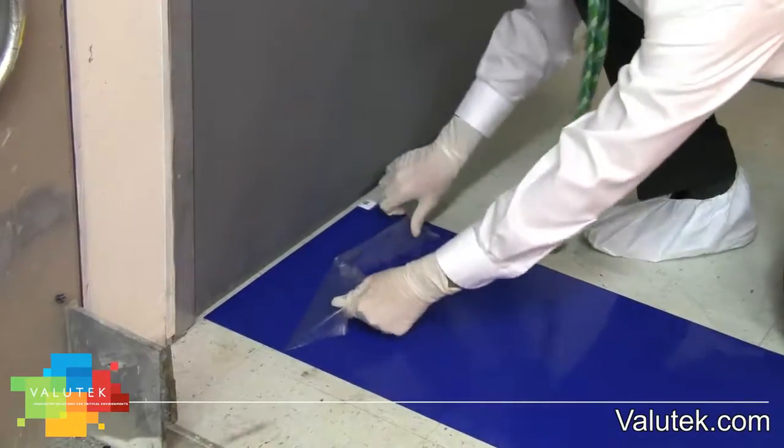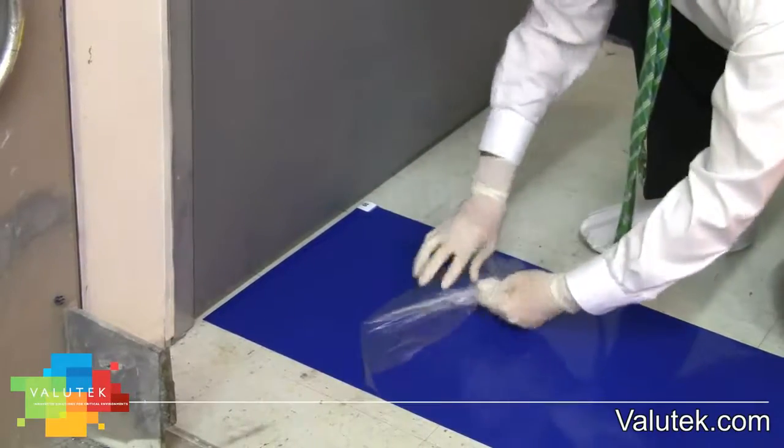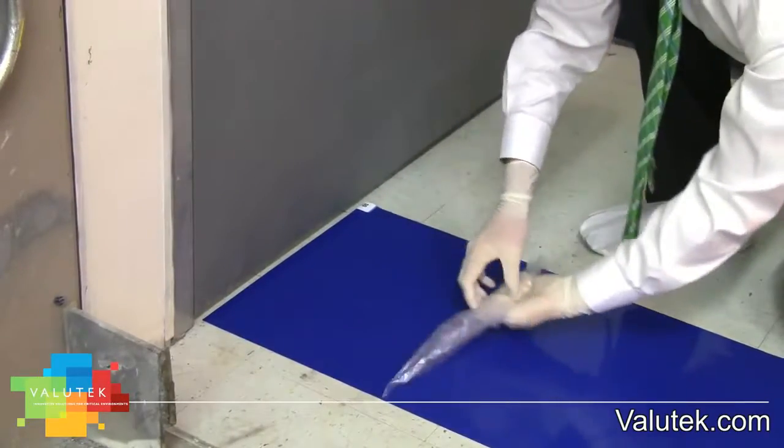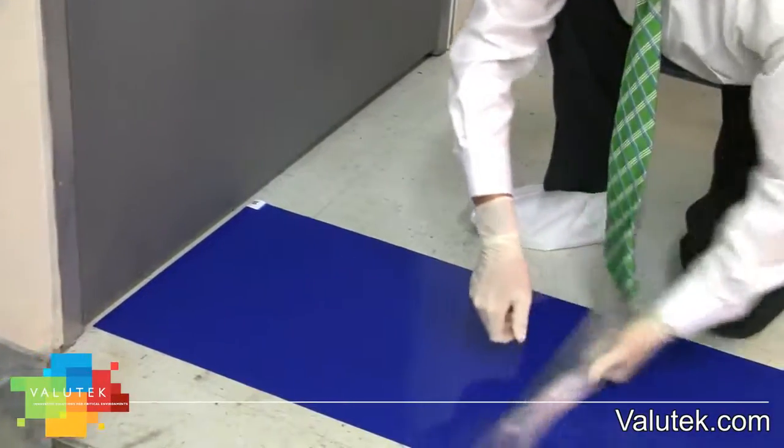Do not tile mats. Tiling is the term used when placing two smaller mats side by side to make the mat area wide enough to fit the entrance width. This is wasteful and creates a space between the mats where contaminants can harbor.